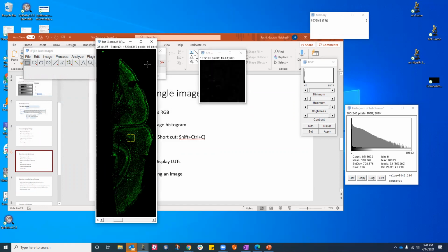It's sparing my original image. It's not doing anything over here. And I get this image right here. Okay. So I never use crop. I always use duplicate. And that way it's very helpful with everything that you do.